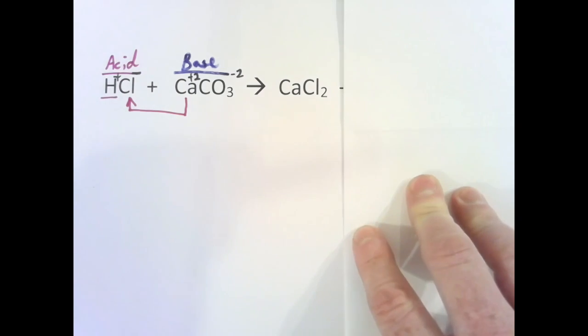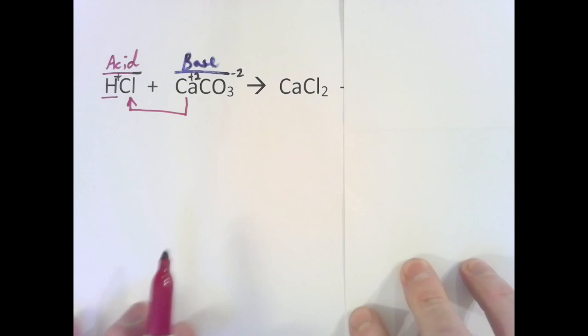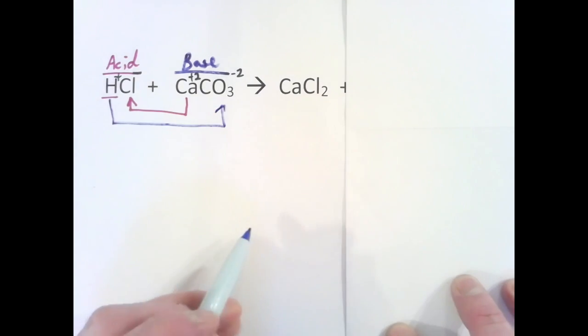Obviously, some other things had to occur. Think about what you saw. You saw bubbles, and you saw bubbles effervescing out from this new chemical, this reaction that was occurring. And then there was runoff. There was a liquid running off of the reaction. Now what happens here is our hydrogen has to be donated to our oxygen.